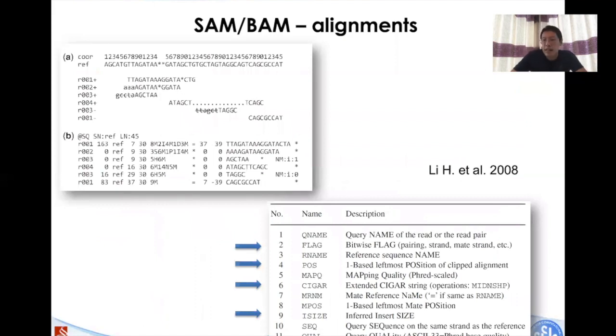All right, now I will give you one example to show what each individual element means in this file. This is one of the toy examples that was published in this bioinformatics paper. So I will go through this with you individually. Again, these are the formats that we mentioned in the previous slides. And these are one of the examples that they provided, so you can see I break it down in detail.